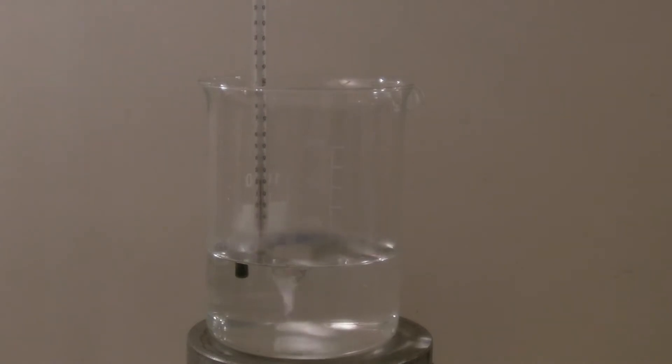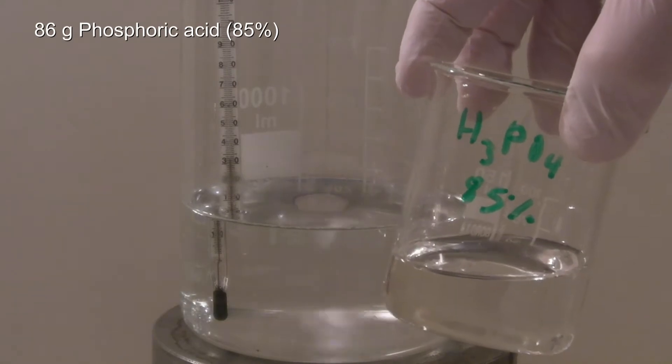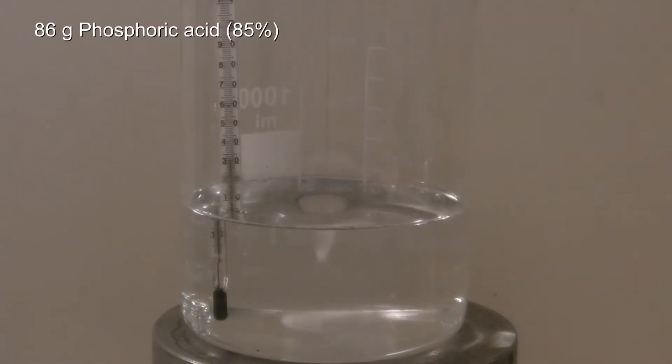Then a thermometer was added to keep track of the temperature. 86 grams of 85% phosphoric acid were added slowly while stirring.